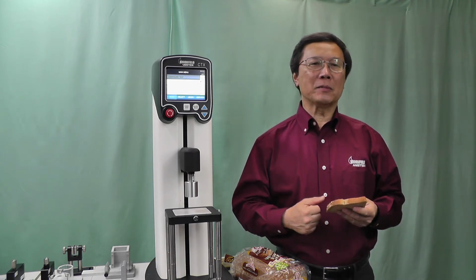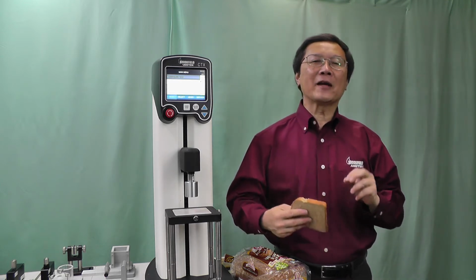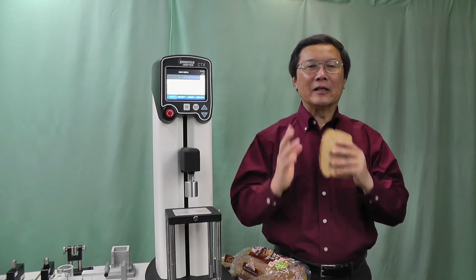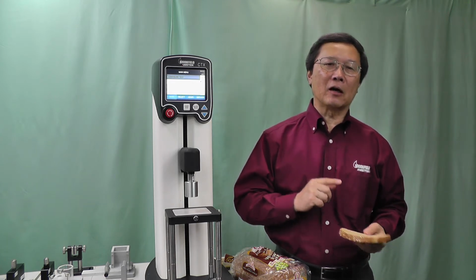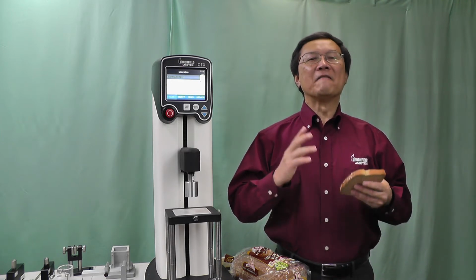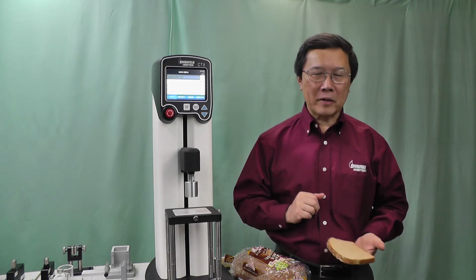Now, this measurement will also tell how springy the samples are. Springiness is defined as the height to which the food recovers during the time that elapsed between the end of the first cycle and the beginning of the second bite cycle. Springiness will reveal how well a sample physically springs back after it has been deformed during the first compression.